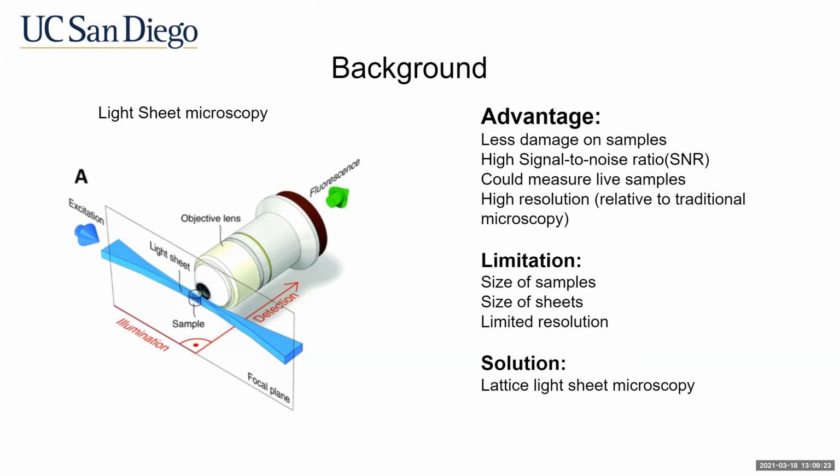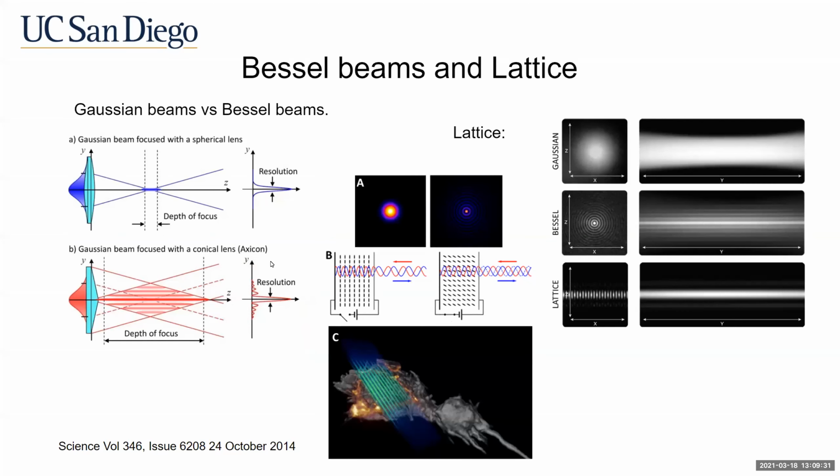The latest light sheet is a combination of techniques, including SIM and Bessel beams. Bessel beams have a high intensity spot surrounded by a lower intensity area, resulting in a much larger depth of focus while still retaining the high resolution.